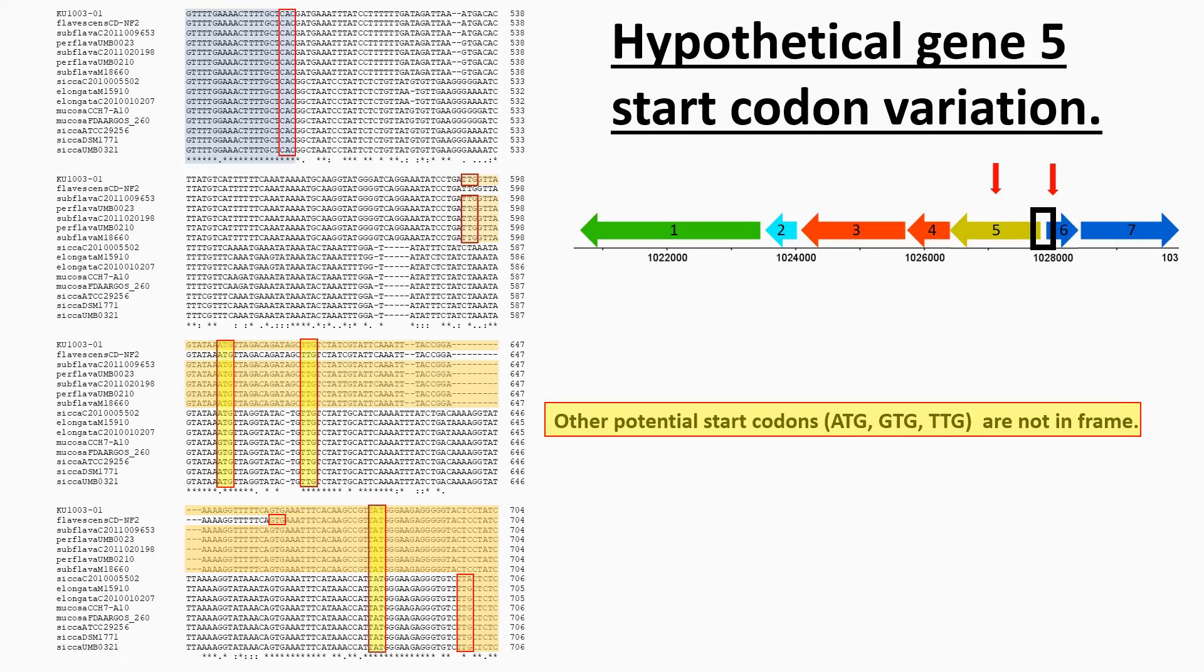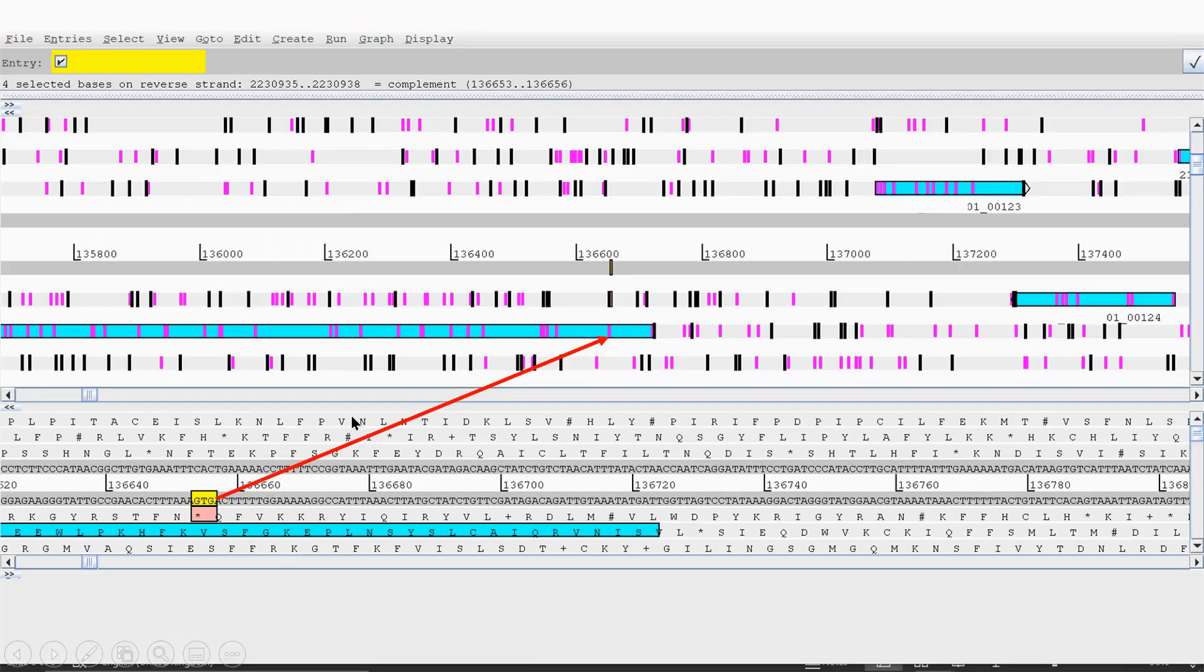I looked at other potential start codons in there. The most common one ATG, as well as GTG and TTG, which I've highlighted here. What I found was these weren't in frame. From this, I was gaining evidence to support this being the start codon for this gene, GTG.